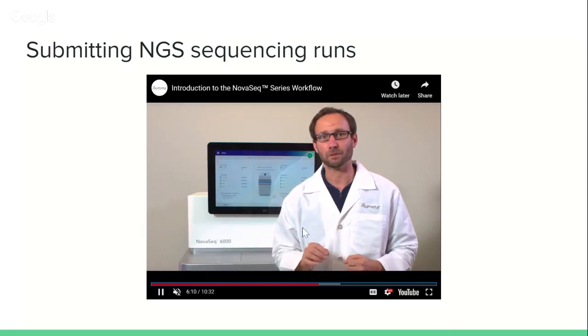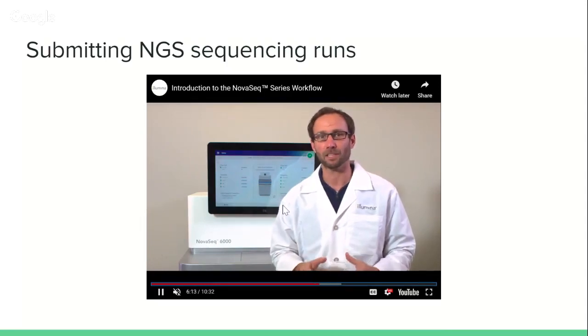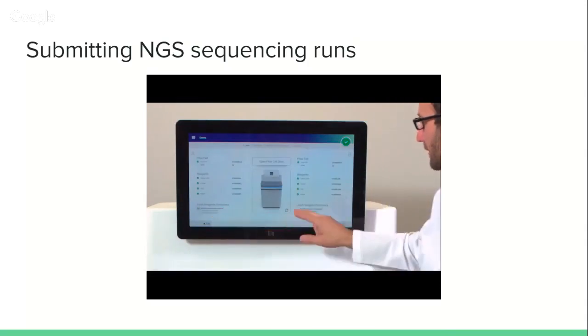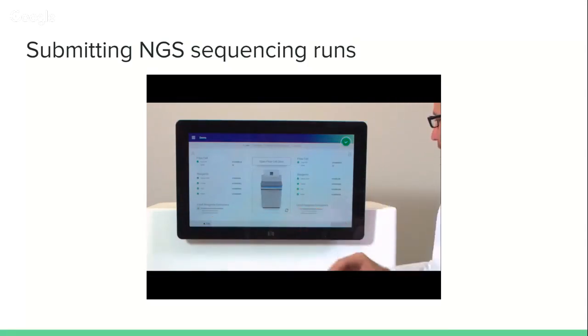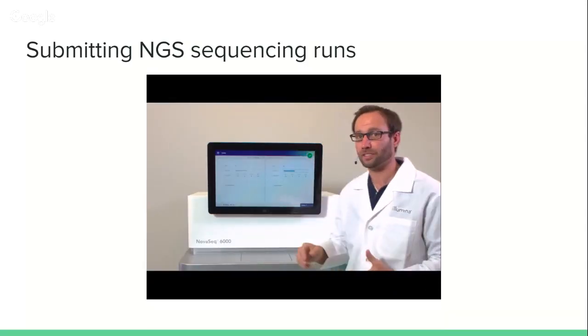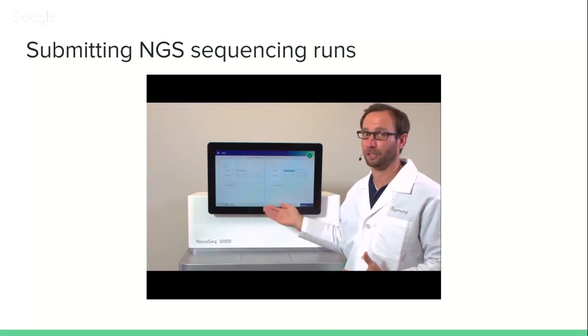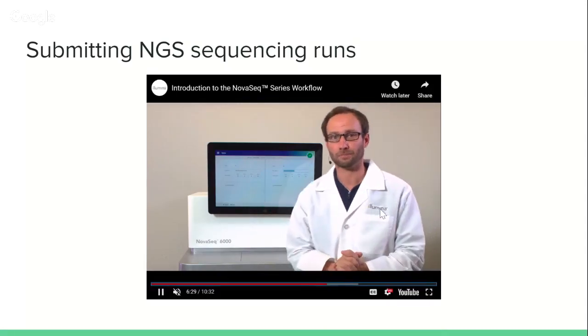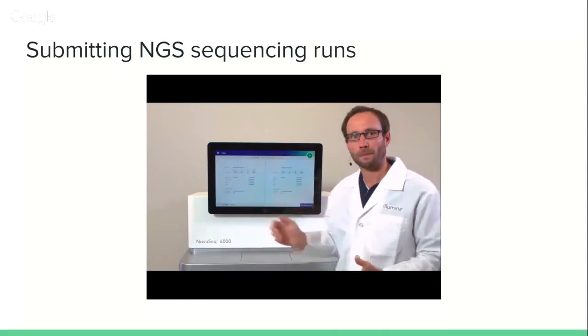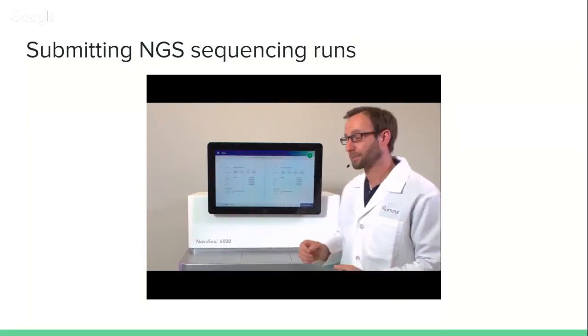The NovaSeq being so high throughput, you'll want to multiplex your samples in, and so Illumina themselves, they offer 24, 48 of up to 96 multiplexing option, so you can put 96 samples. If you had a batch of 96 from the previous step, you can put it directly in one of the flow cells. If you require more sequencing, you can split your pool into more than one flow cell.